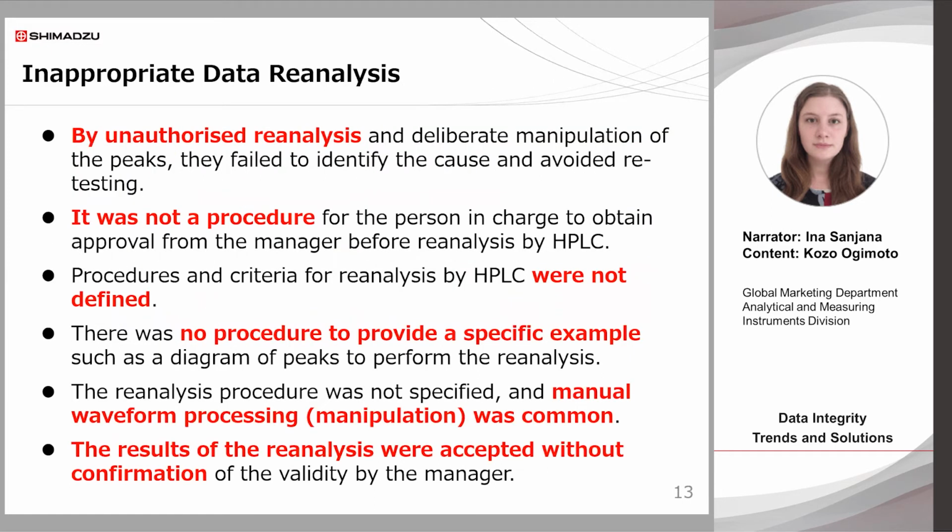This slide shows cases of inappropriate data reanalysis. As you know, in chromatography systems such as LC and GC, reanalysis, especially manual peak processing, has a direct and significant impact on the results. In some cases, it's possible to deliberately manipulate a failed test so that it passes.